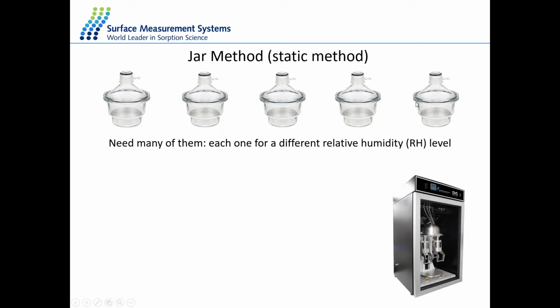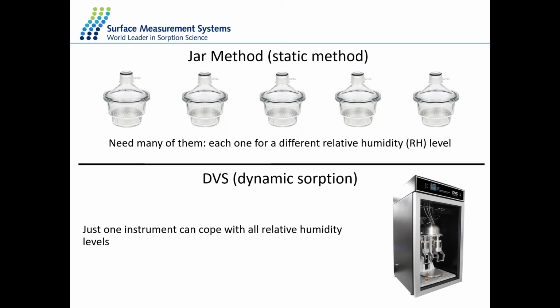The same methodology in concept is used by a DVS. We generate different levels of relative humidity, and we constantly measure the mass of the sample using a microbalance. That's basically the same idea. The process is done continuously rather than being done staggered throughout a series of desiccators.